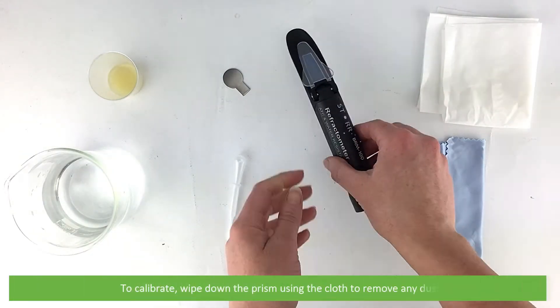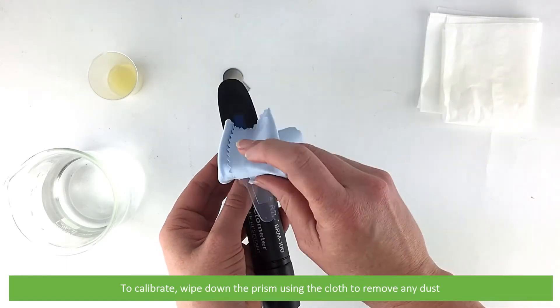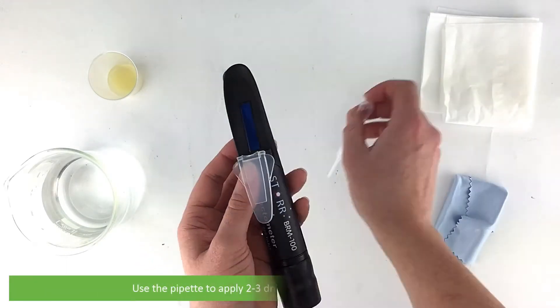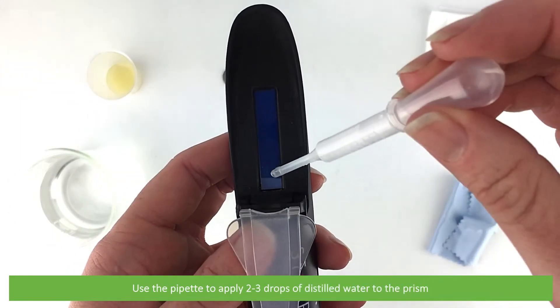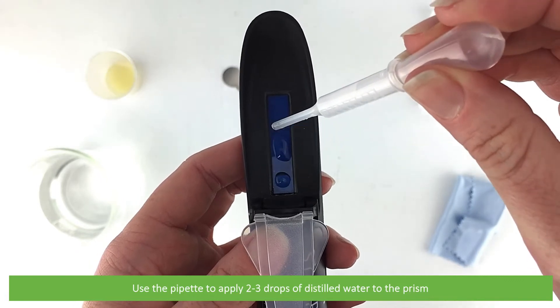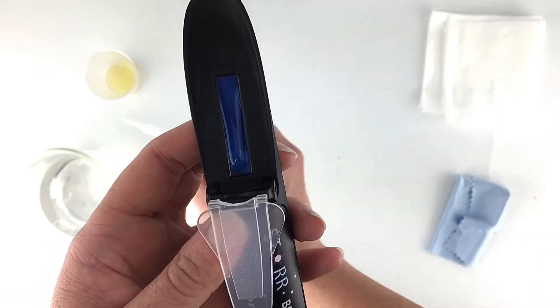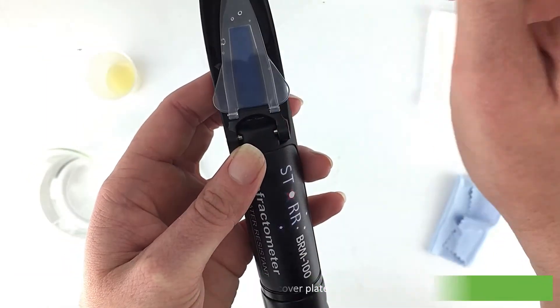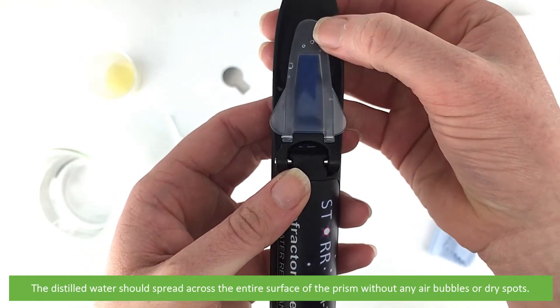To calibrate, wipe down the prism using the cloth to remove any dust. Use the pipette to apply two to three drops of distilled water to the prism, then close the cover plate. The distilled water should spread across the entire surface of the prism without any air bubbles or dry spots.